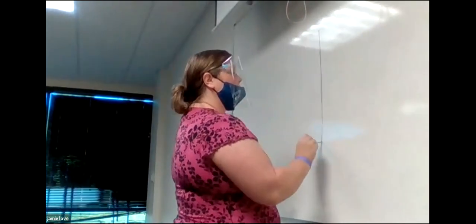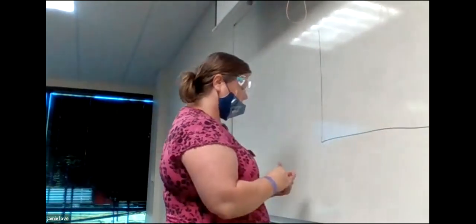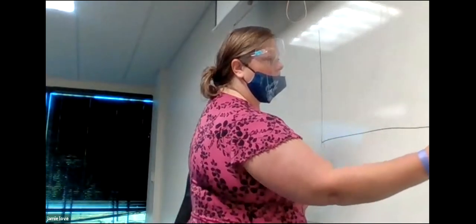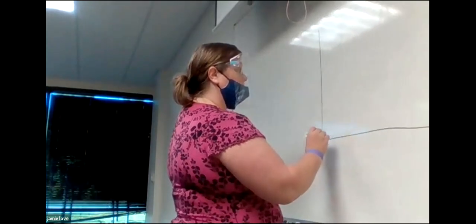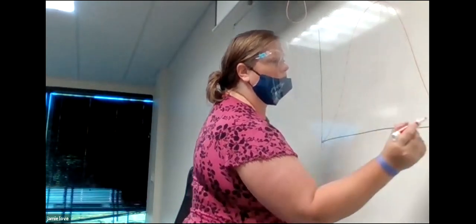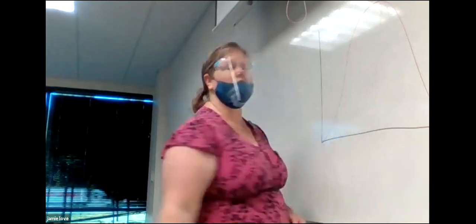Sure, which one you're talking about. So we have this spectrum going like this. And we have the level 0 and then 100 at this end. And then it slopes up and comes down and then stops just before 100. So I'm kind of guesstimating that that's about 90.